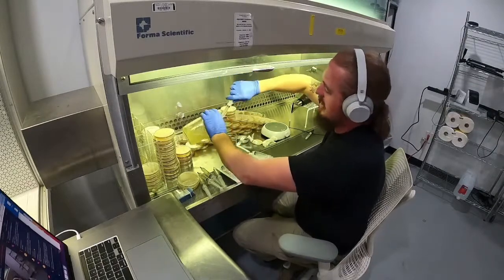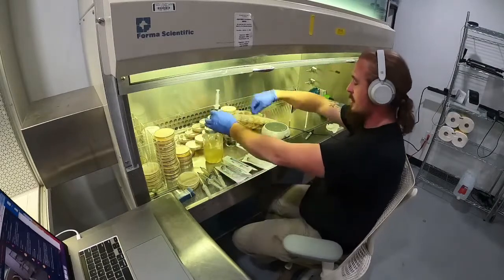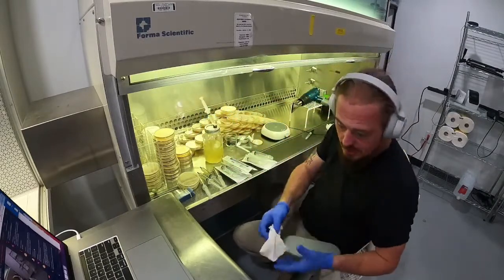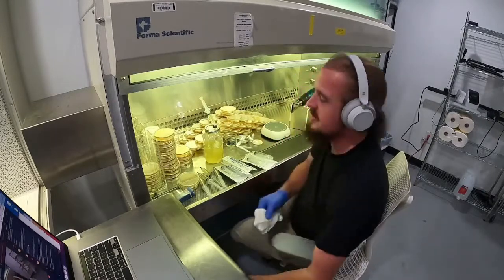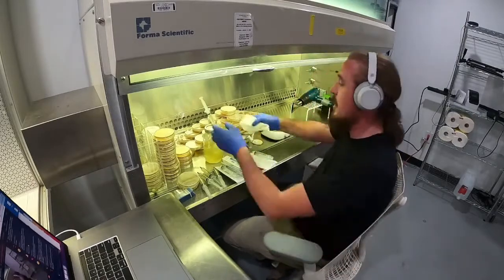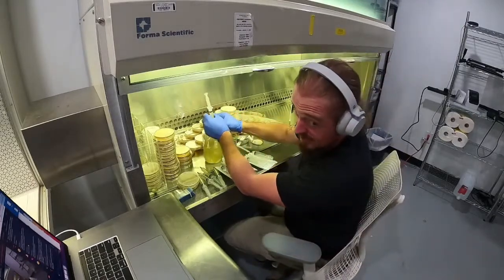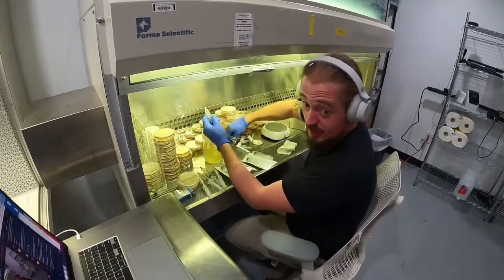Yeah, I've looked at the bottle method of farming, and the big problem with the bottle method is you're trading off waste in your washing and maintenance process for single-use plastics, right? You're basically trading things off. Now, I'm not going to advocate for single-use plastics. Trust me. There's a reason I've got Pleurotus ostreatus sitting here chewing on some.